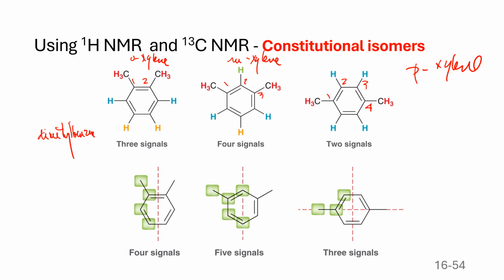Well, here you have the proton NMR types in red. But I'm going to just put letters here, probably easier. So, A, B, C, C. And you can see planar symmetry here. AC, right? And this. So you can distinguish that. Now, here, this molecule, you do have a planar symmetry here. So these two are the same, and these two are the same, but here you have this is different to that, so it's 4 signals.